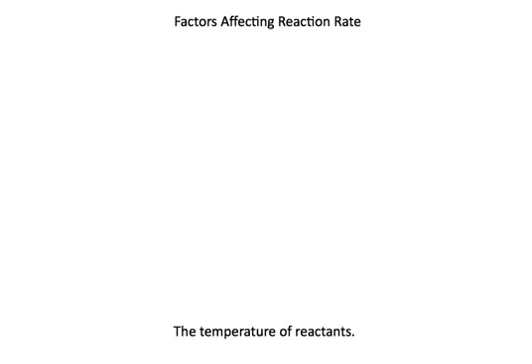Same amount of water, pretty well the same amount of sodium, but the temperature was quite different and the rate of reaction was affected quite dramatically. So that sodium reacting in the hot water looked more like a reaction to potassium in hot water, but that's because the water was warmer. Next.